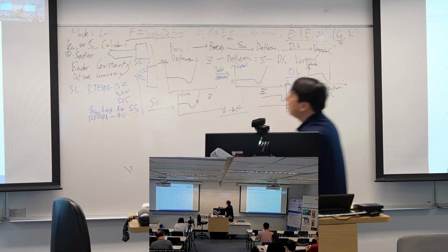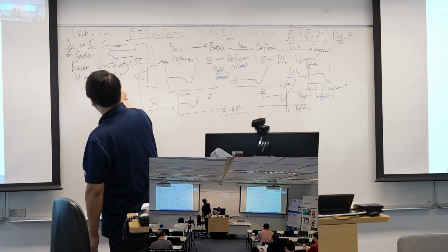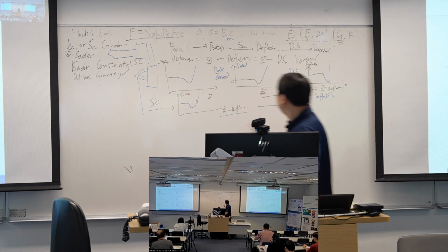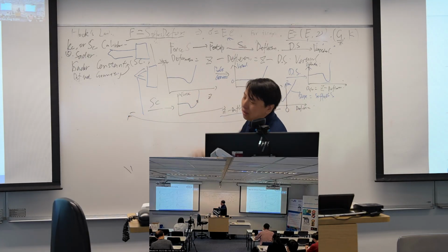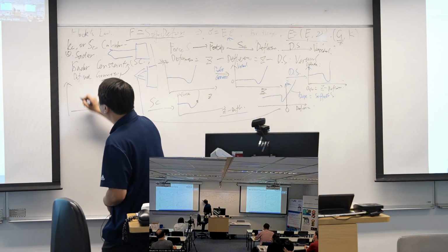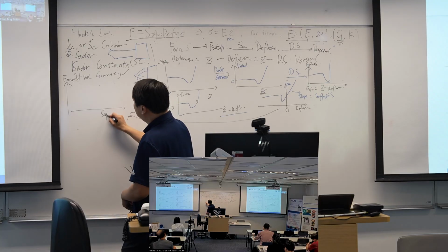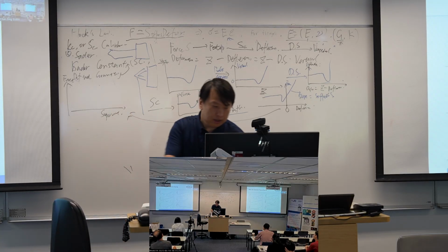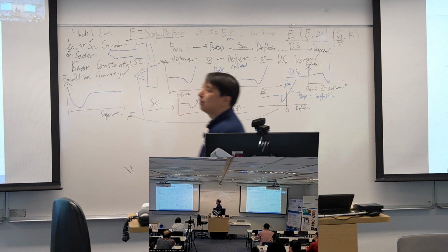And now we can tell from this curve, if you make a sweep, it will change to this kind. So it's force, and Bruker said it's separation. And now the curve goes to something like this.